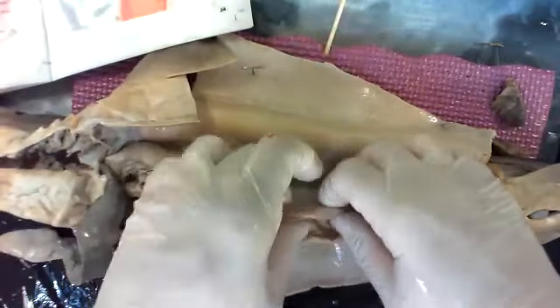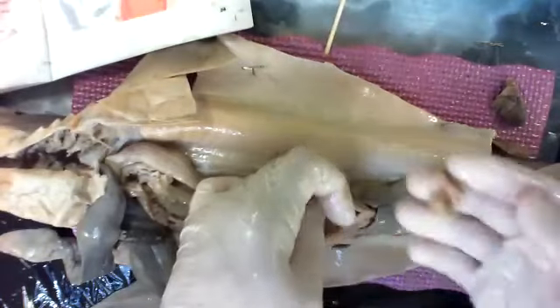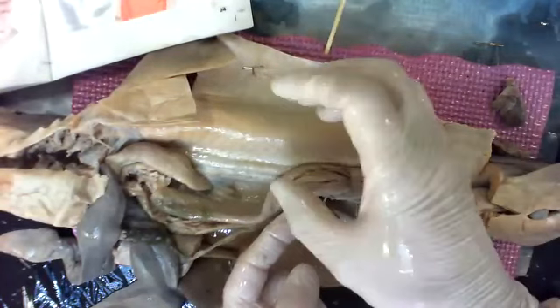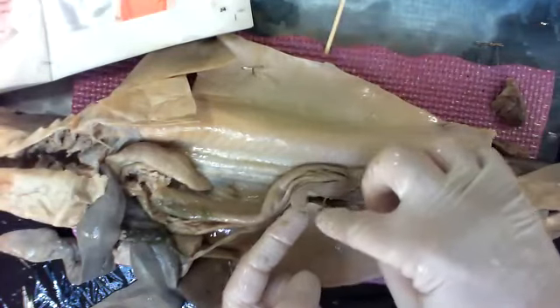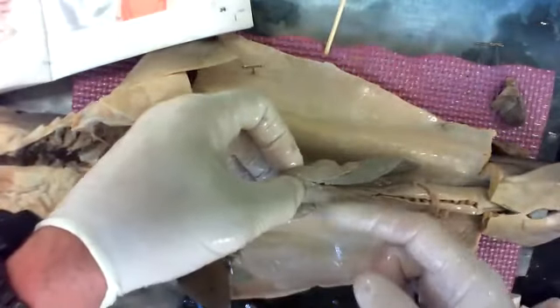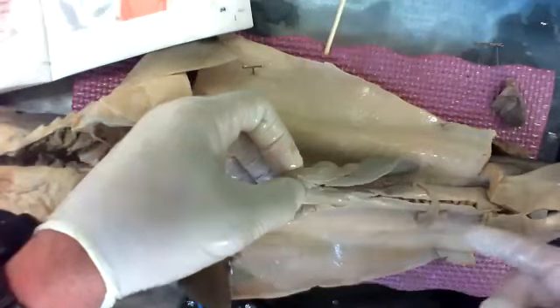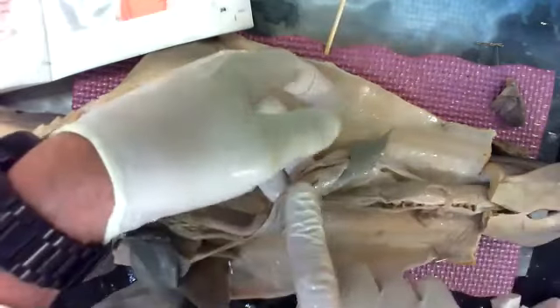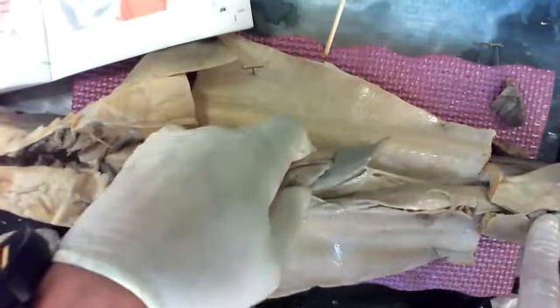Pushing it down until it's like baby food, like this paste here. When it's paste-like, this sphincter, this round muscle, opens up and lets squirts of baby food go into the intestine. The intestine has to spiral it around, right, all the way down. As it's spiraling it down, it's squirted with chemicals that break it down. The good stuff comes into the bloodstream, is carried away, and then the poo exits the cloaca.